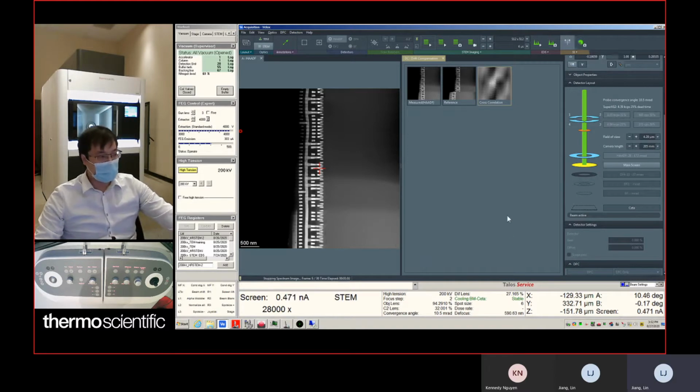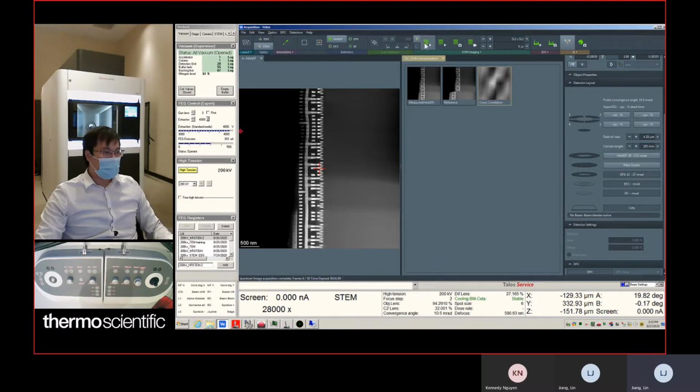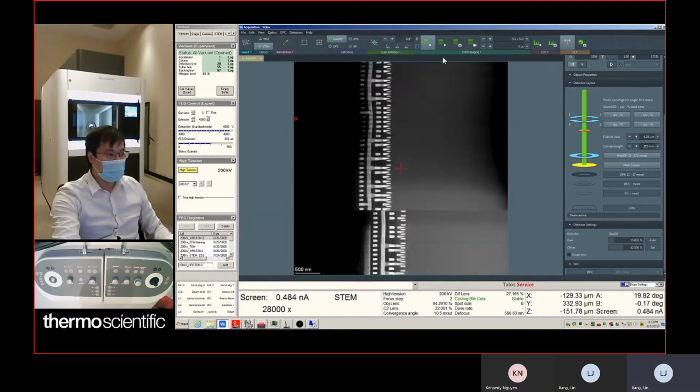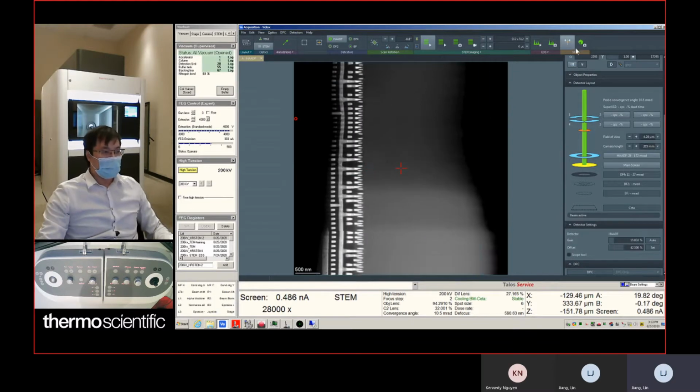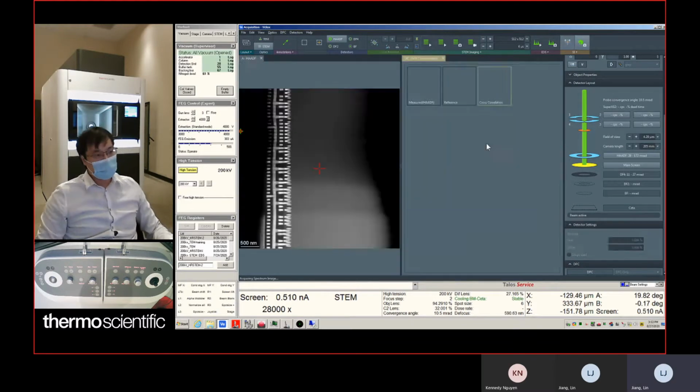We can go further. We can do 20 degree setting to see how much count we got. And we get to 20. We do 20. But now it's 15. Go to 20. Okay. We go 20. We open the view. Move them to the center. And then we can just start.